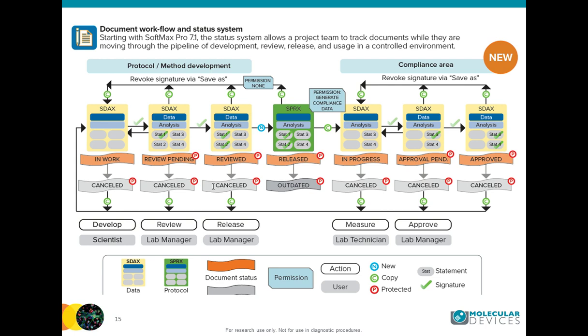Okay. At this point, we don't have a direct way to interact with the LIMS system, as there is a pretty large variety of LIMS systems out there. But we are looking into improving this interface. So if whoever asked this question can send me an email, I'm more than happy to include him in the SoftMax Pro Insider program. So I can work with him to basically look at his requirements and see what we can do in one of the future versions for him.